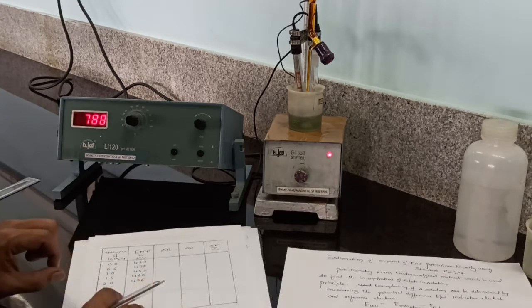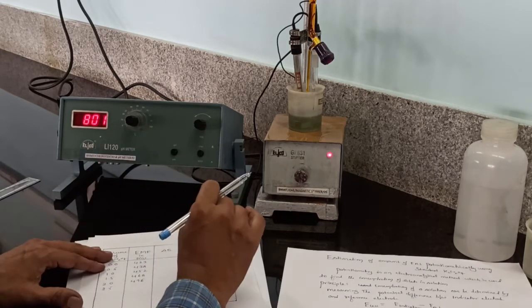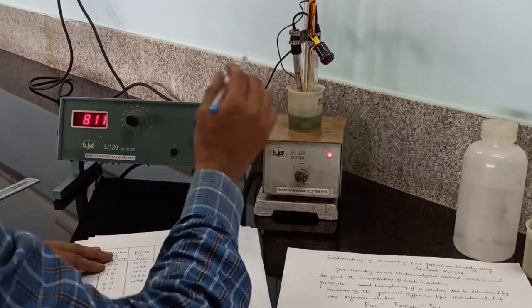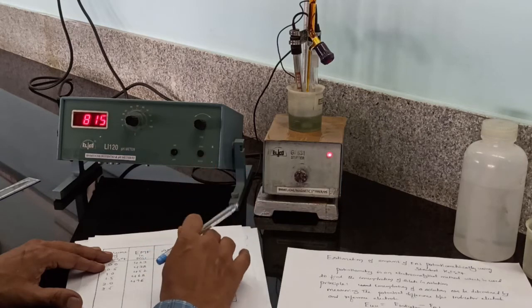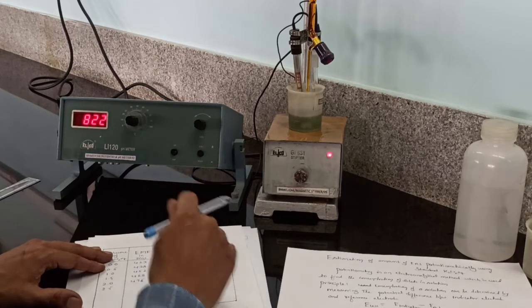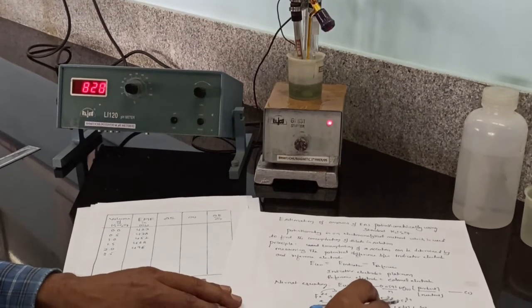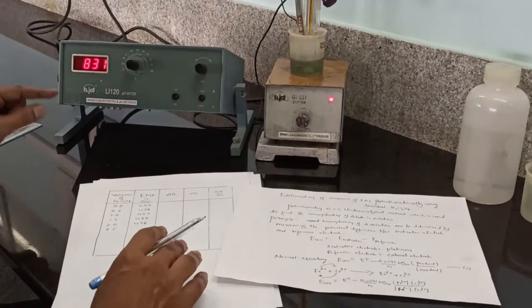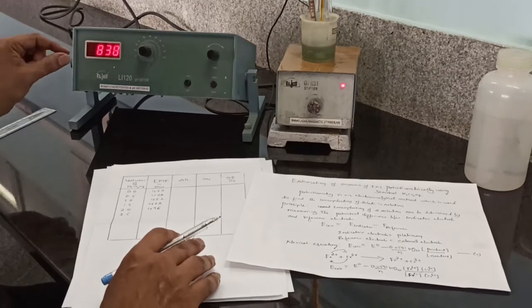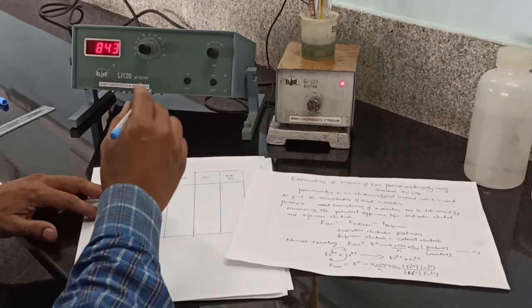We are seeing the rapid rise in EMF at 2.5. So this point is called the equivalence point. The equivalence point means the point at which the amount of titrant added is equal to amount of analyte substance in the solution. At this point, all Fe2 plus ions are oxidized to Fe3 plus ion. According to this Nernst equation, the concentration of Fe2 plus tends to 0, we will get log infinity. That's why we have seen the rapid rising EMF, if the difference between the previous reading and current reading is more than 200 millivolts. Note down the values and continue the titration.